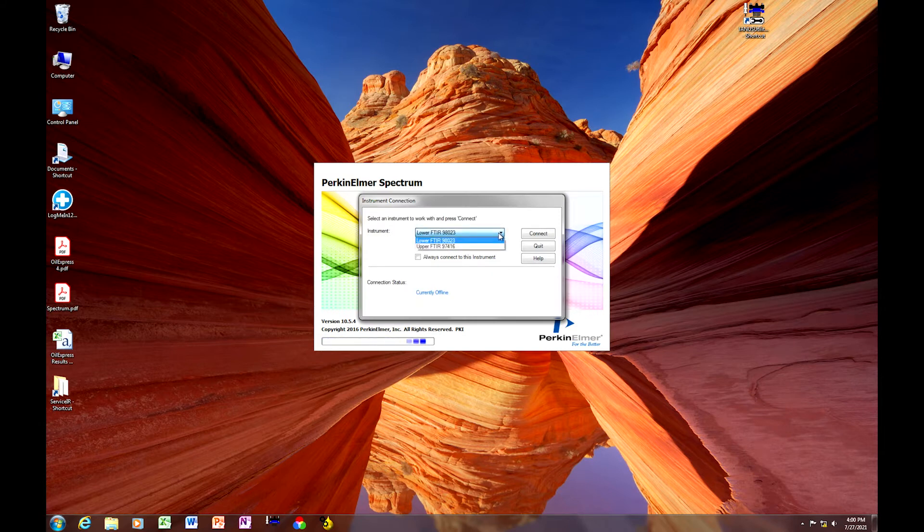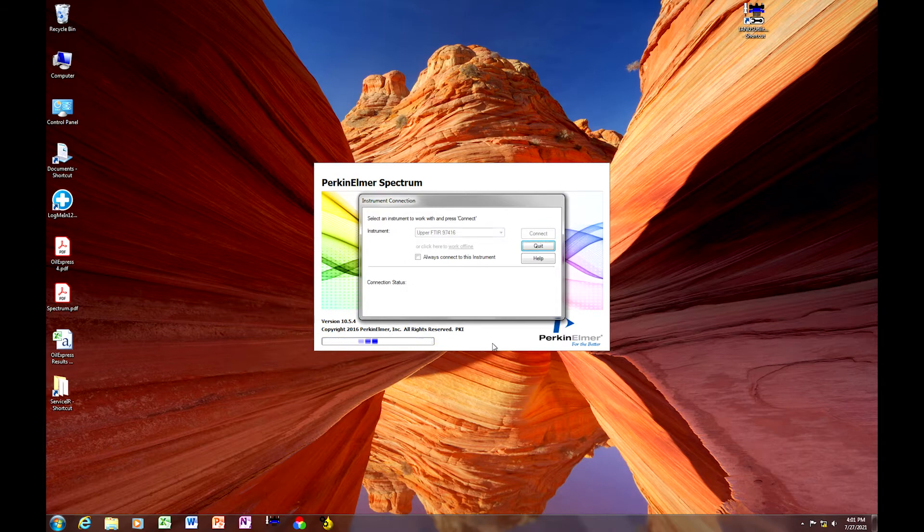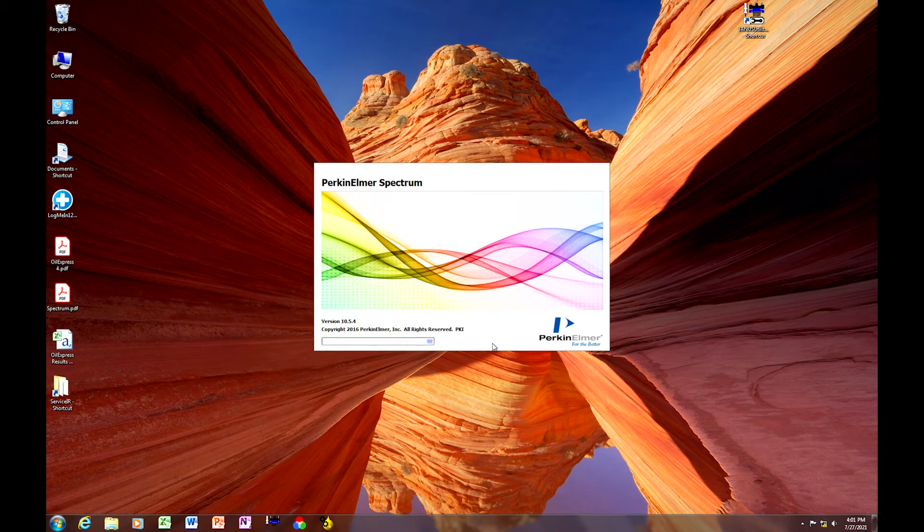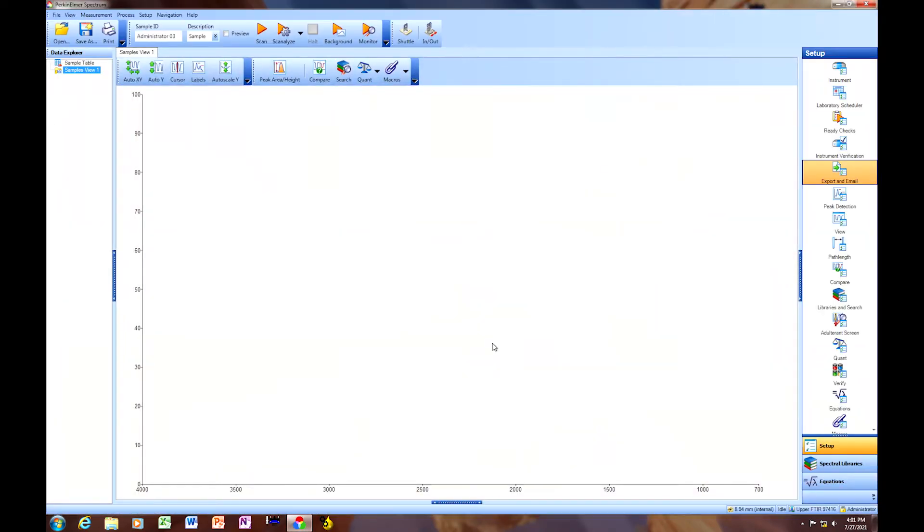We're going to connect, in this case, to the upper FTIR. If your instrument has a single FTIR, it may automatically connect, and you do not have to select the instrument.